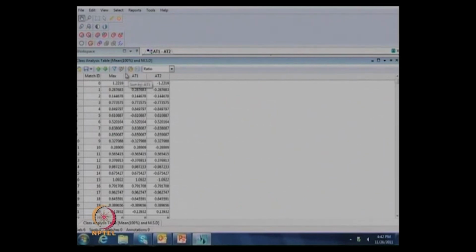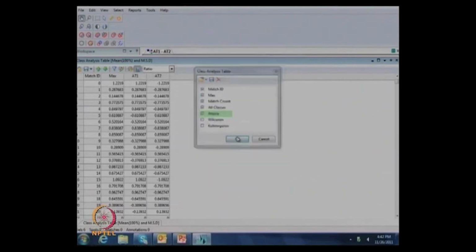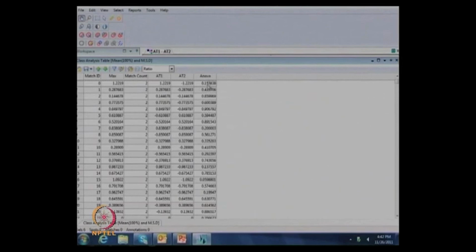Okay, and I think we need to add. Yeah. Now this is the statistical parameter, on the basis of which the software gives you the option of doing different types of statistical analysis. Exactly. So this is the ANOVA value which we can see. On the basis of this ANOVA value, we can easily select our protein of interest, and you have the fold regulation also. This is 1 fold up-regulated and this is 1.2 fold down-regulated. The same way you can see the whole values.